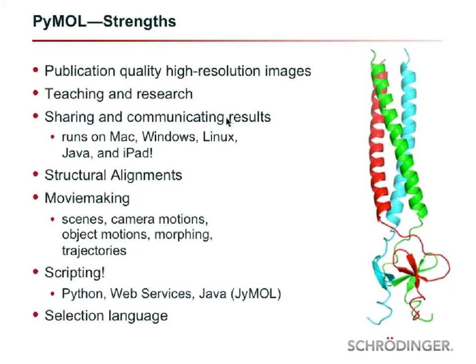The more advanced usage of PyMOL is down here. Starting with movie making, you can make animated movies like simple camera motions, zoom-ups on details, but also object motions or even interpolations, loading trajectories, and then combine all of those. I will show you examples and a demo later in the session.